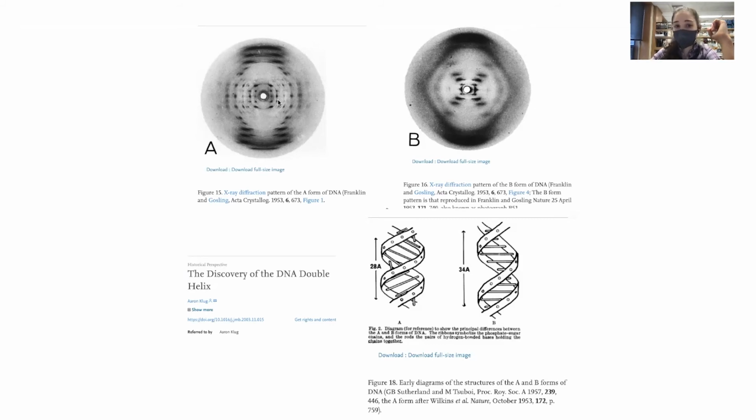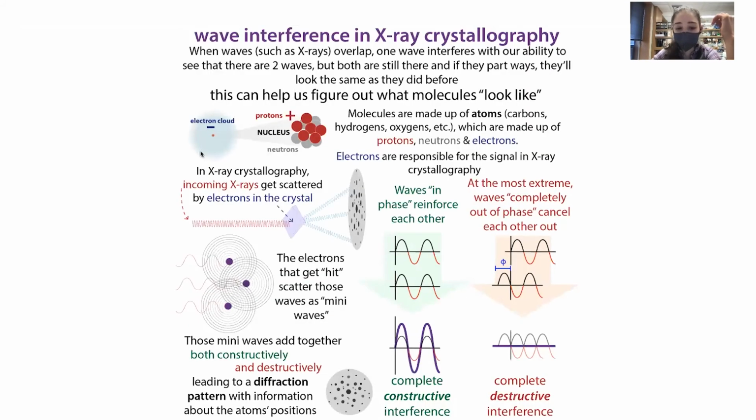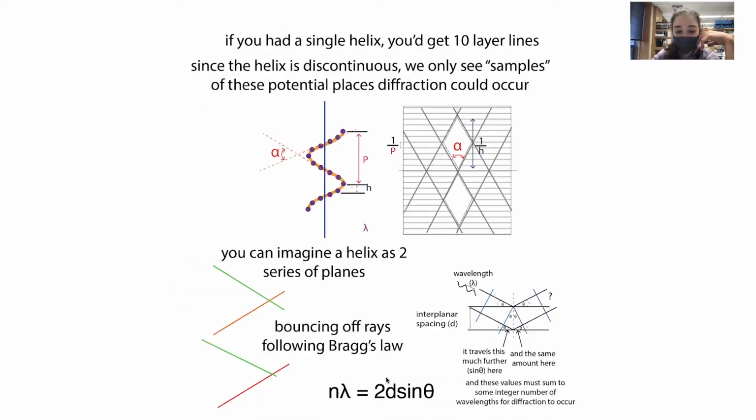When they were trying to do things before, they were getting crystalline or at least semi-crystalline forms, where you had crystals of DNA that were kind of oriented, kind of fiber-like. So you can see that you're actually seeing diffraction spots interfering with the fiber diffraction pattern. These are more like what we see when we do X-ray crystallography, where we have a distinct pattern of spots rather than layer lines.